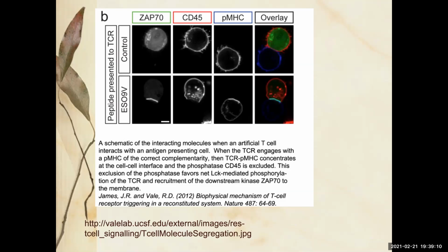And so you get a black and white image out of your scope, and that's okay. You know that in real life it was giving you bright green. And then you can go back and apply a lookup table, and look, it's bright green. Same thing for the red channel, same thing for the blue channel. And then this is an overlay. So there were 3 images, and here they are, 1, 2, 3. So green, red, and blue. By the way, it's the usual order in which you present the images. Just for convenience, we always present the images as green, red, and then blue.